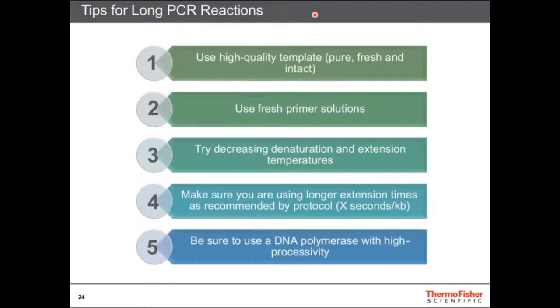So as discussed earlier, there are some key tips that you want to remember when doing long PCR. You want to make sure that your template is pure and fresh and fully intact, and hasn't been degraded in any way. And again, use fresh primer solutions, so you're getting very specific binding and annealing of your primers.